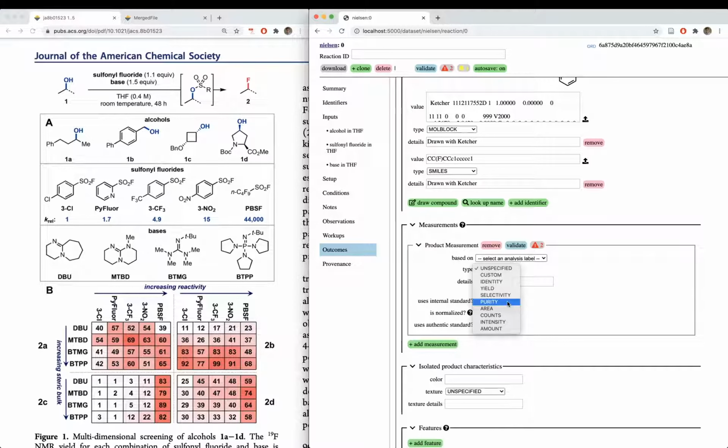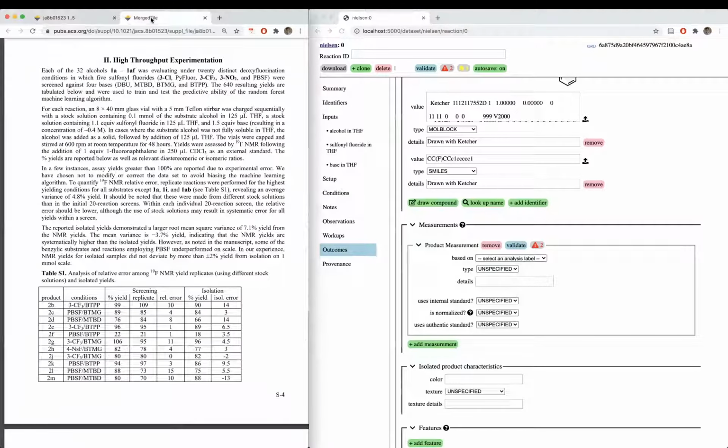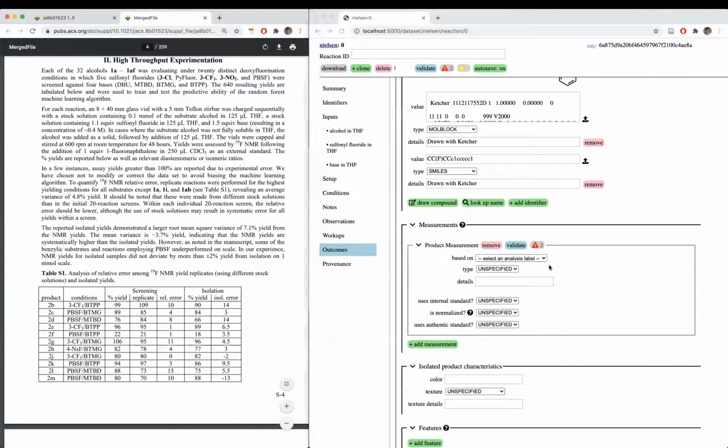If we are using mass spec for quantification, again, uncalibrated, maybe we just call that an intensity at a specific EIC or an integrated EIC. But for this use case, we're dealing with yields, right? We're dealing with quantitative yields, right? With some error, of course.